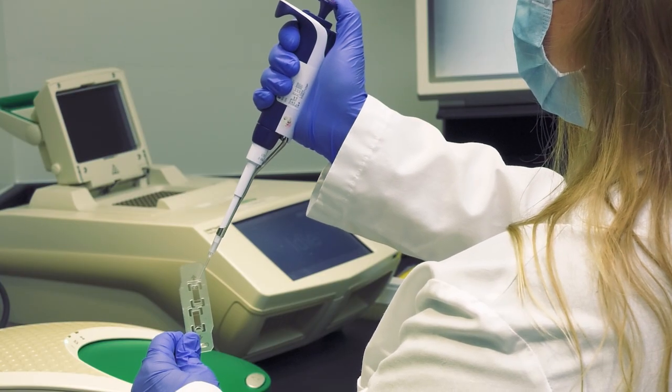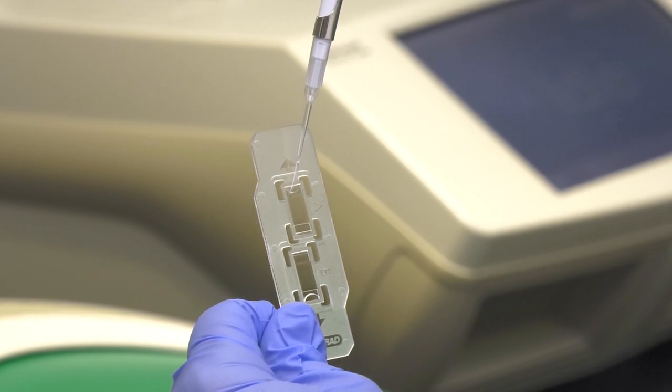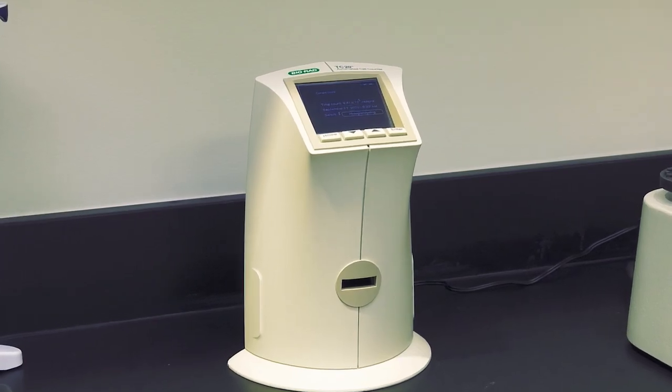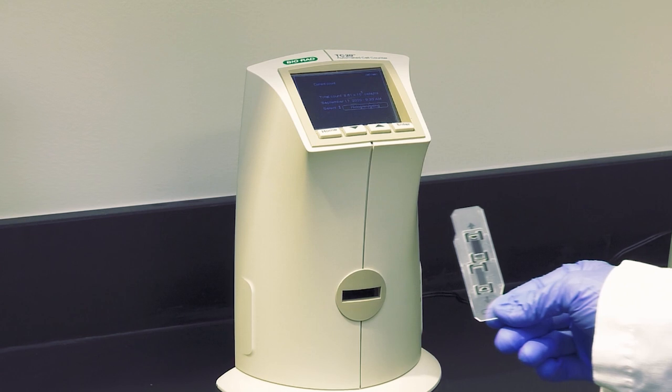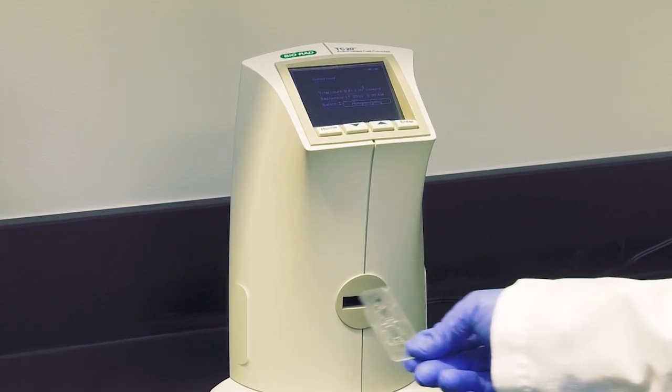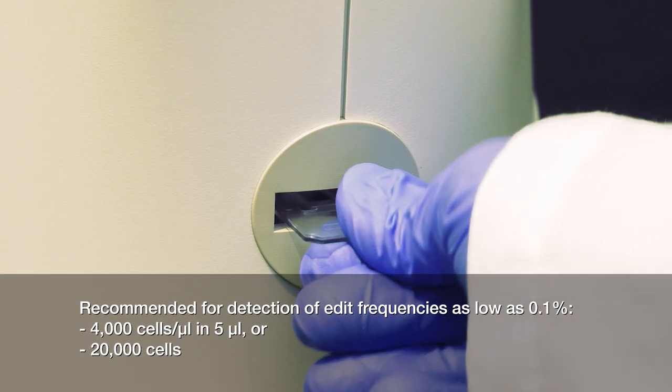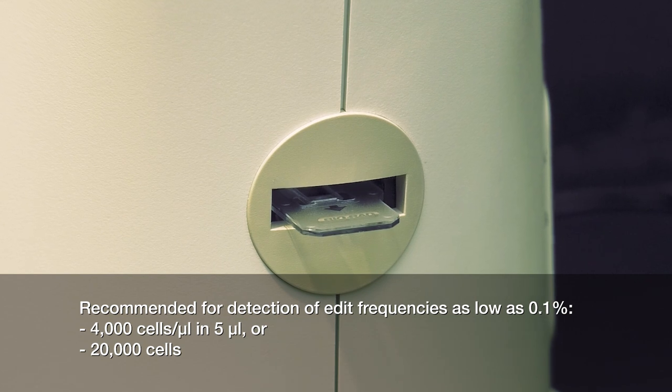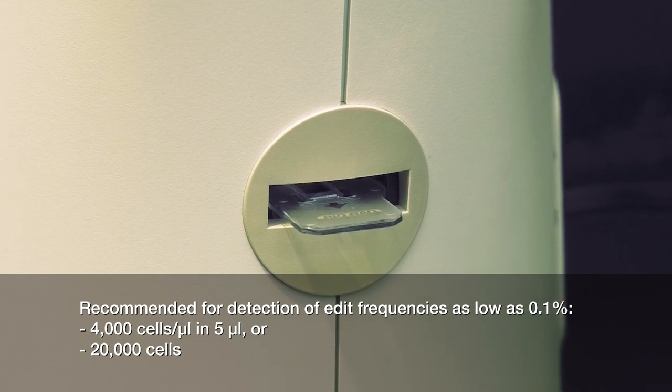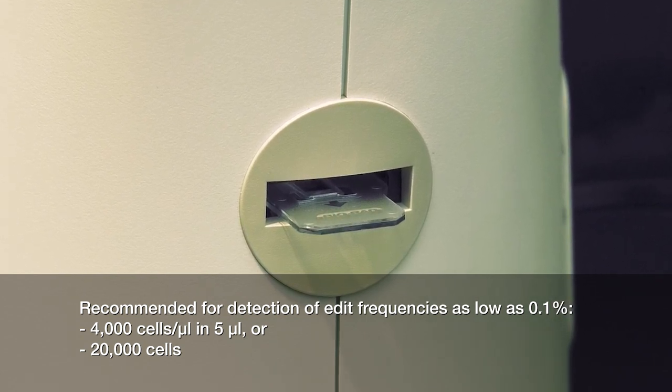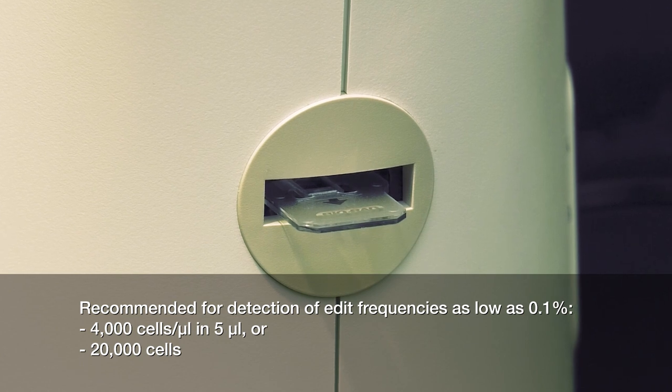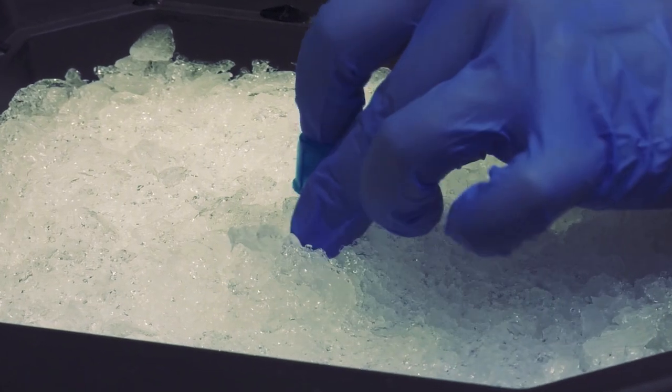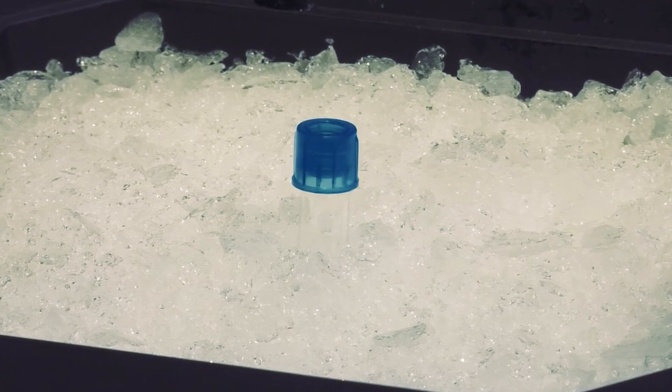Next, count your cells. We recommend checking replicates with BioRad's TC20 automated cell counter for an accurate cell count and assessment of cell viability. A count of 4,000 cells per microliter in 5 microliters, or 20,000 cells total, is recommended for detection of an edit frequency down to 0.1%. Keep cells on ice until they are added to the DDPCR reaction.